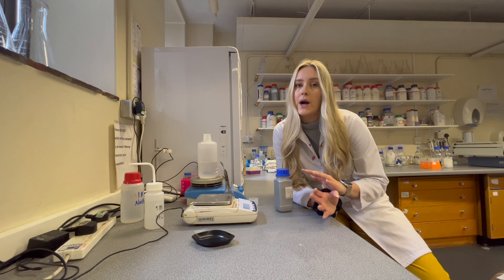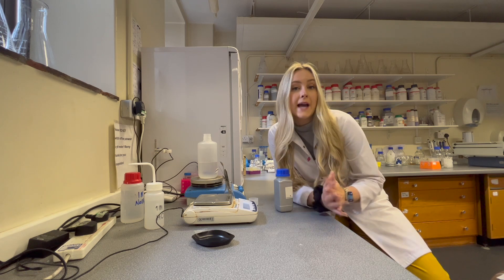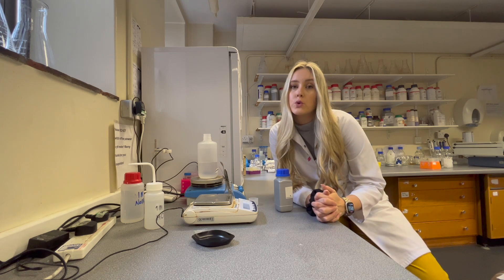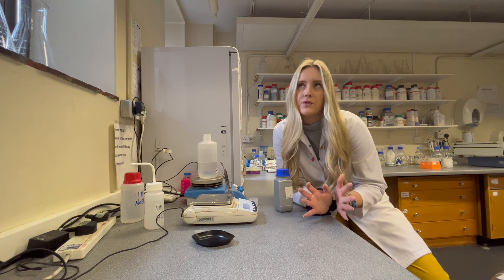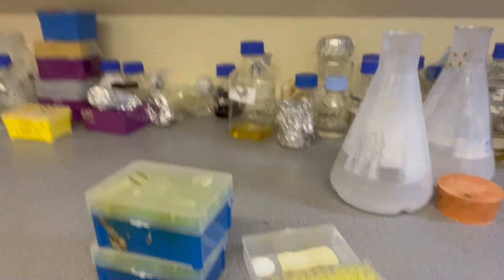I'm going to run some more bioassays to get the data to fill in those gaps and try to finish off those two chapters, which would be amazing if I manage over the next month. My colleague Julius came in as I was recording, so I'll tune in later. I've prepared the media, it's in the autoclave, and I'm preparing some tips before heading to the library.